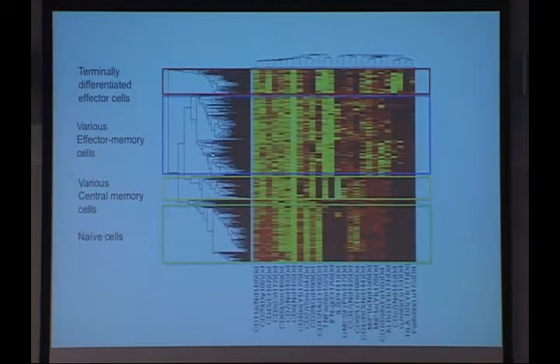But then it gets confusing once you get into this heterogeneity and what do you do with that. And also the problem with the way this is set up is it doesn't have this mechanism for clustering multiple samples together and then showing them all separately the way SPADE does, where you can sort of overlay multiple samples. And so every sample that you do, you get a completely different output. And so you have to kind of look through and reinterpret it each time. And so it's not good for really making any statements about the data, but to me it's an interesting way of looking at also sort of the quality and what kind of diversity you have within your data. So I'll leave it at that.